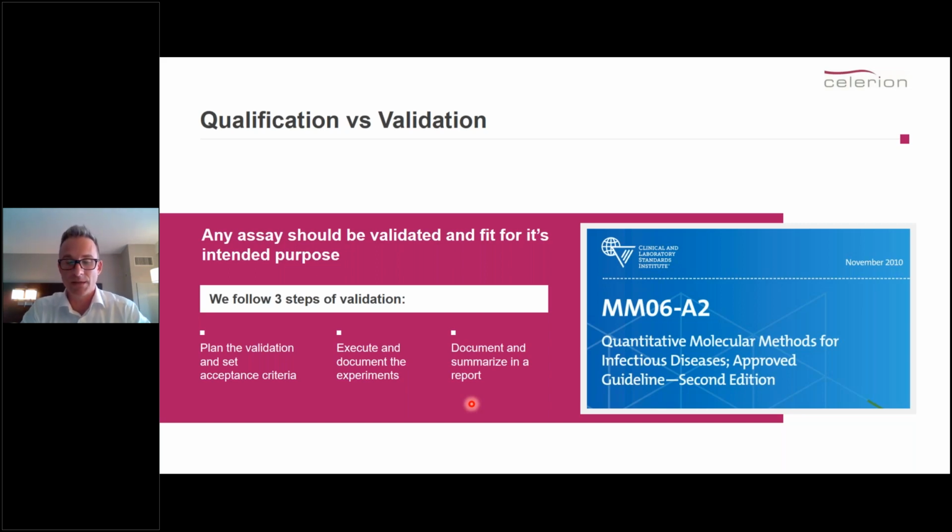And also the raw data, of course, is available, and all the instruments that are being used for the validation are suitably qualified and traceable, including all the materials that have been used for the validation. So again, these aspects apply, and these are the minimum standards really I would want to see for any method that's used in a clinical trial.